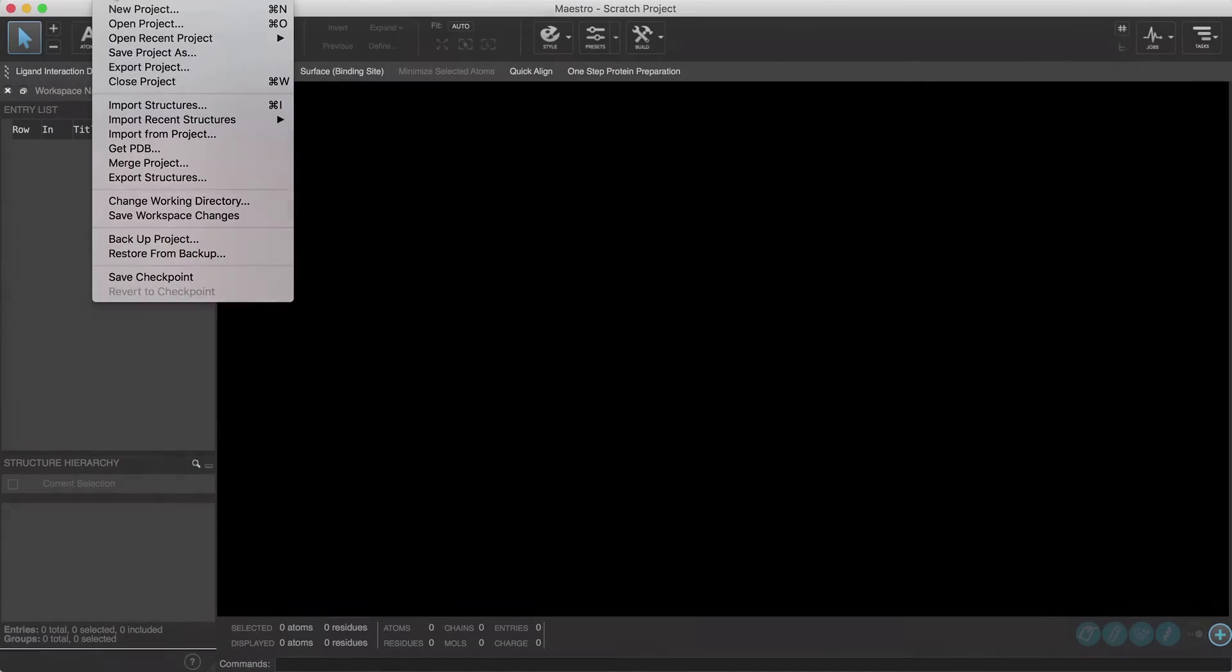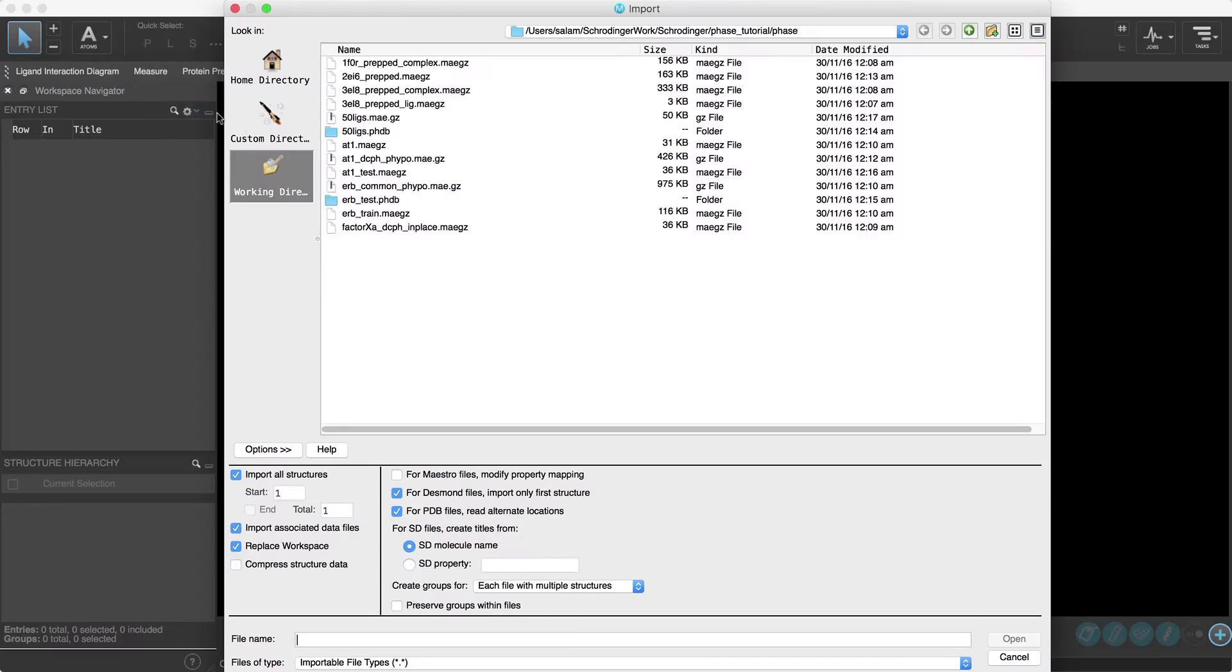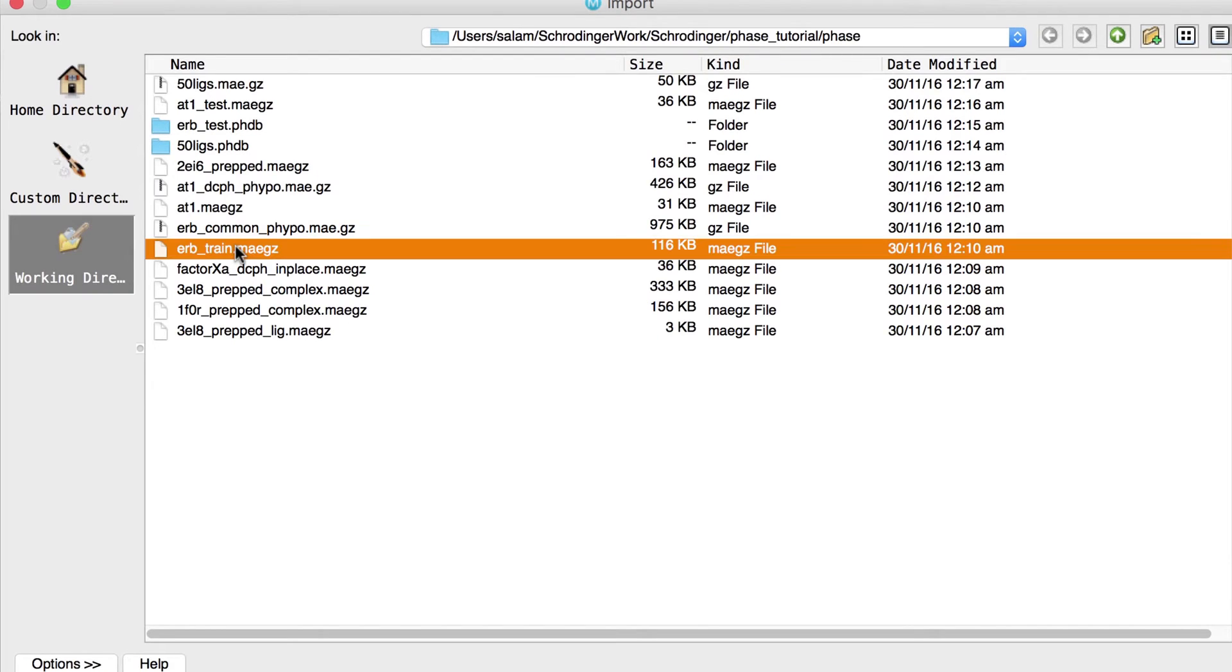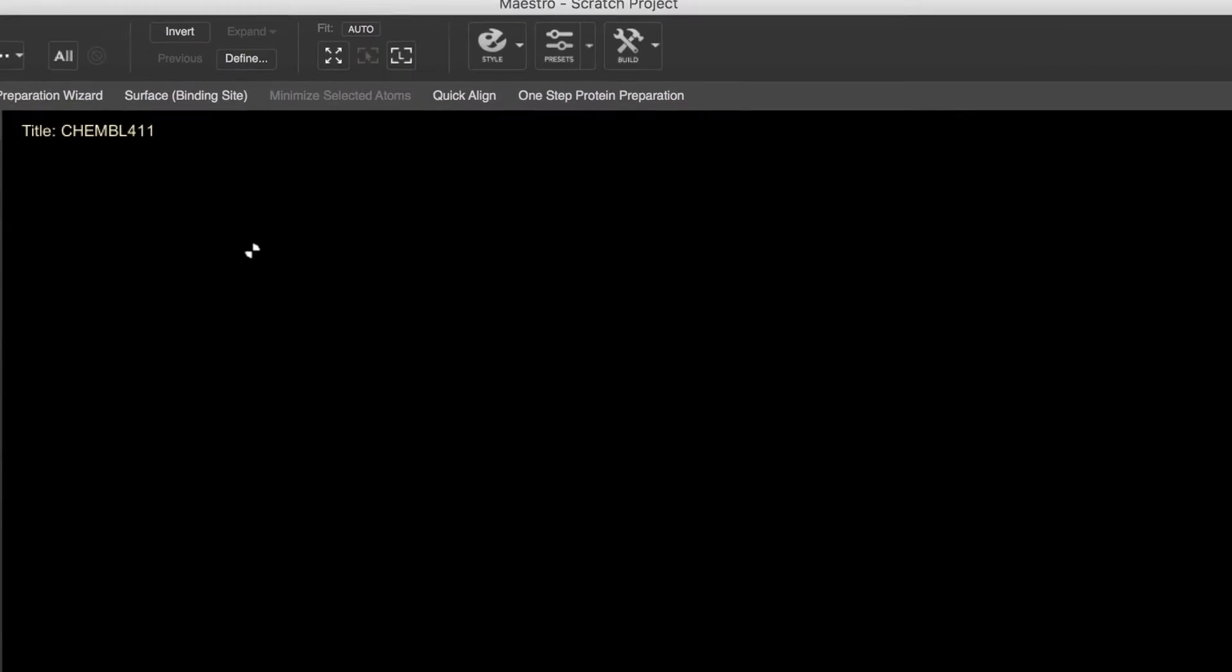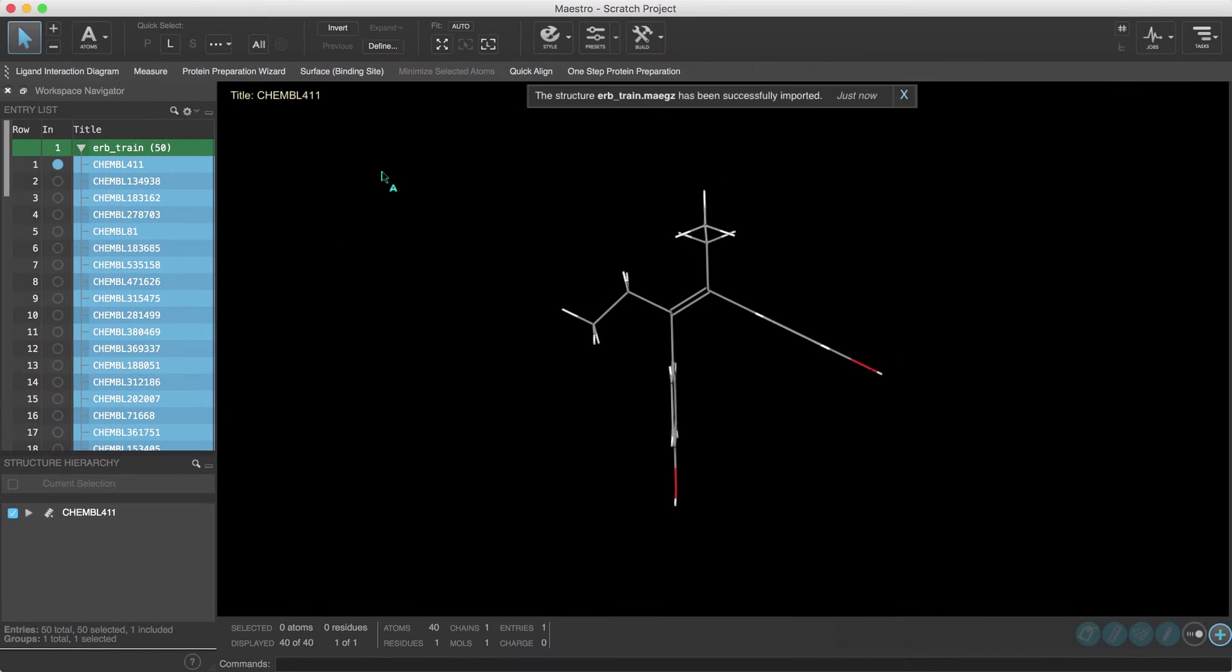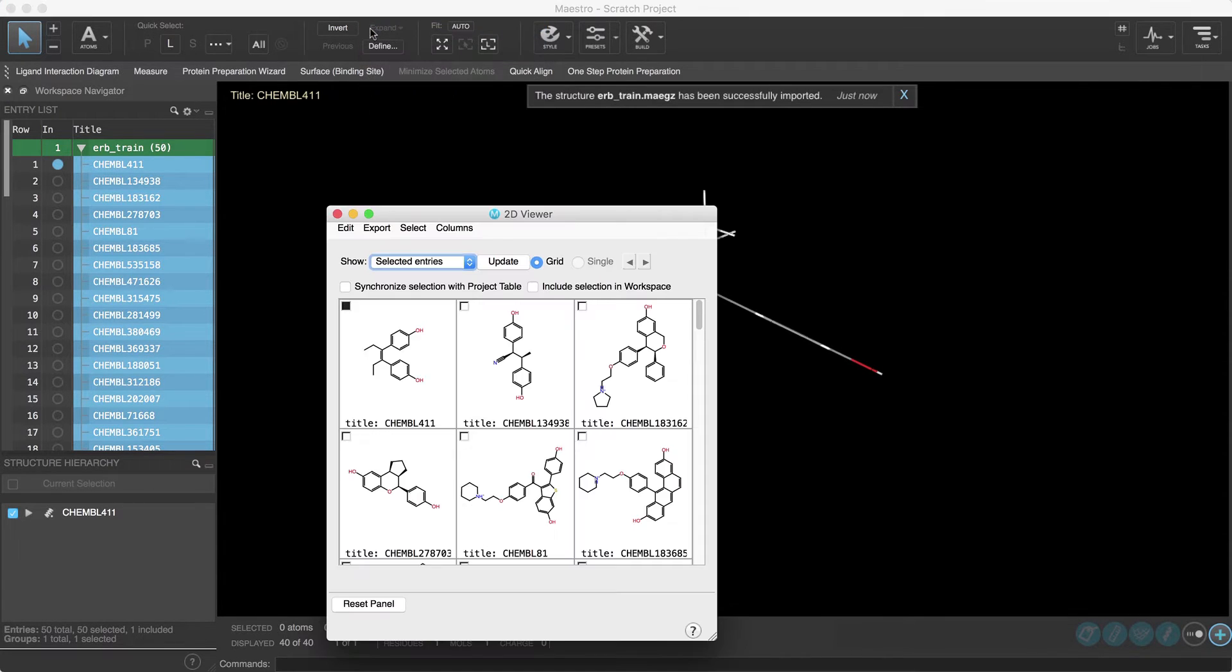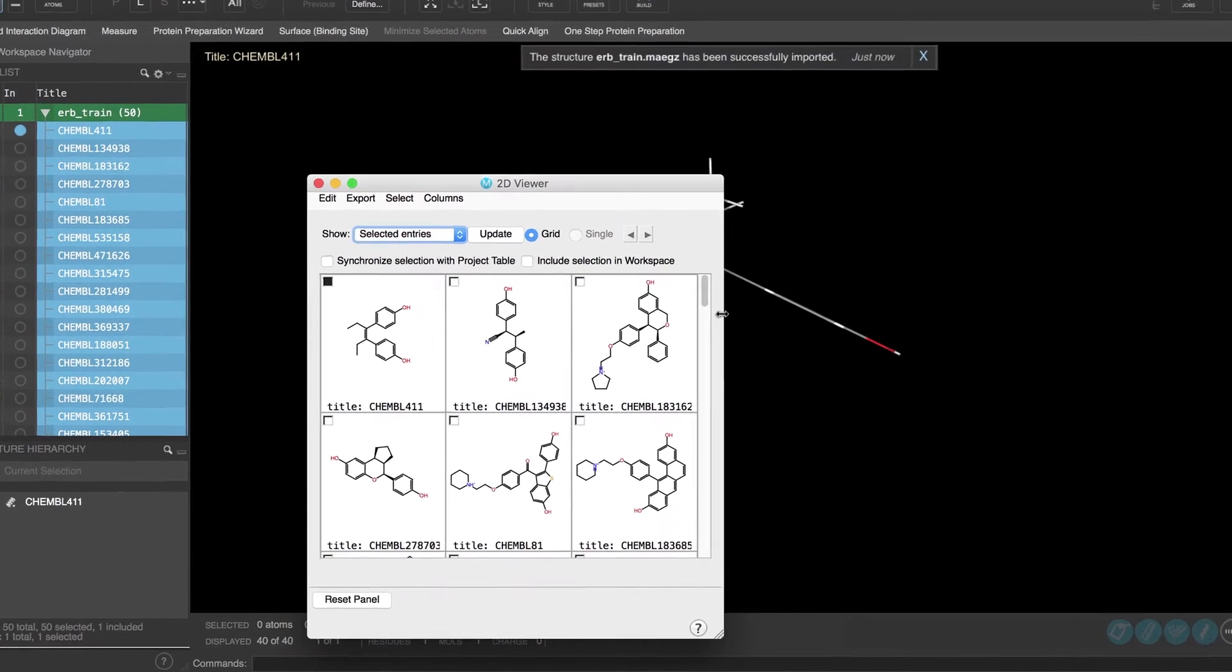We'll start by importing the ligands which in this case is the file ERB_train. Now before we open the pharmacophore panel let's examine the structures in 2D by opening the 2D viewer from the window menu.